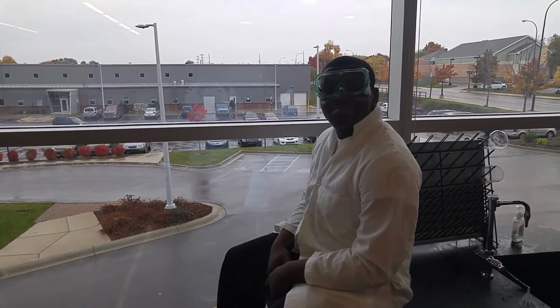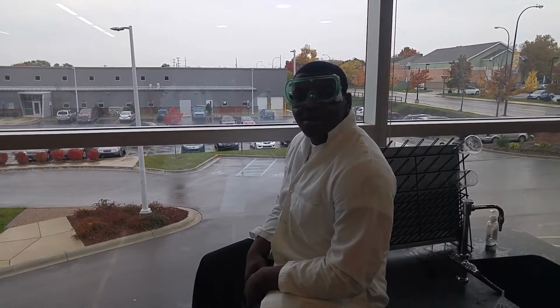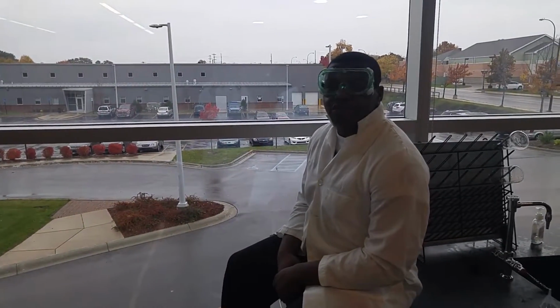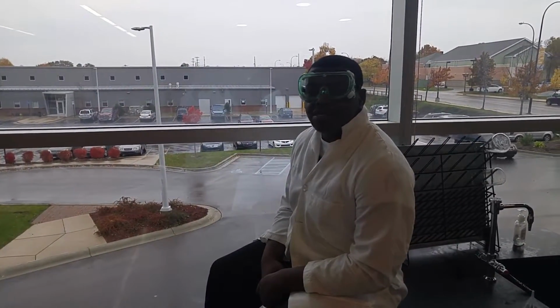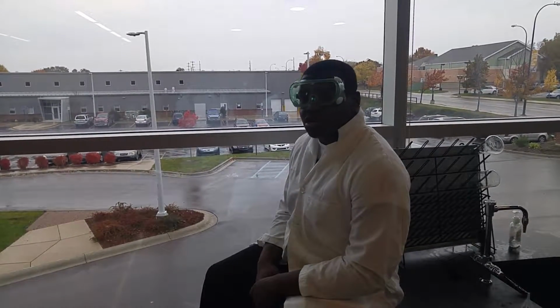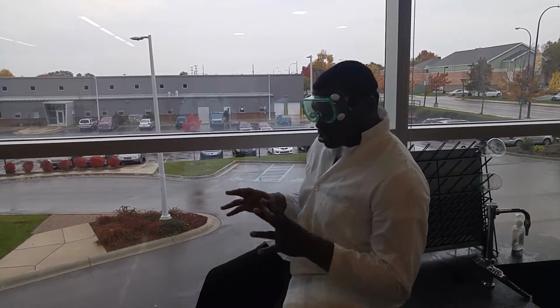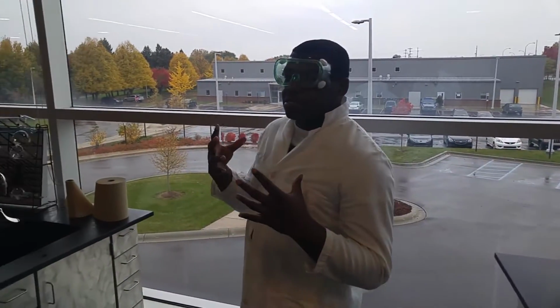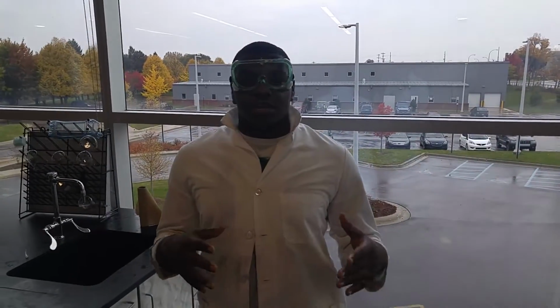Hello, I'm Dr. McNasty. And I'm here to talk to you today about an app me and my lab partner have created for electrophoresis simulation. Basically, let me tell you what electrophoresis is first. Electrophoresis is when DNA is loaded into a chamber, and the DNA fragments that are created from enzymes that cut the DNA in specific places migrate a certain distance based on the DNA size.